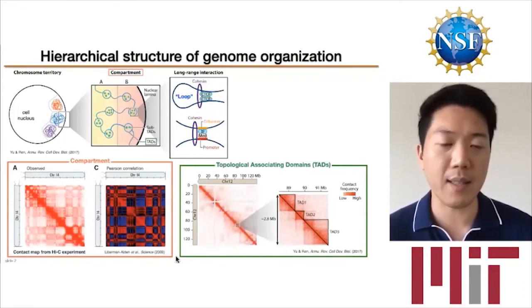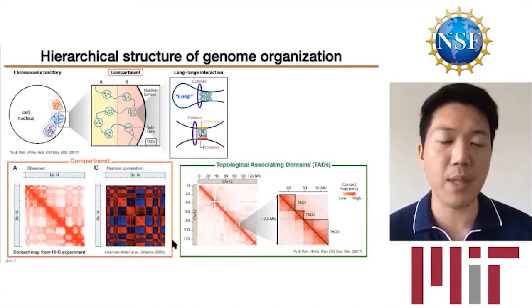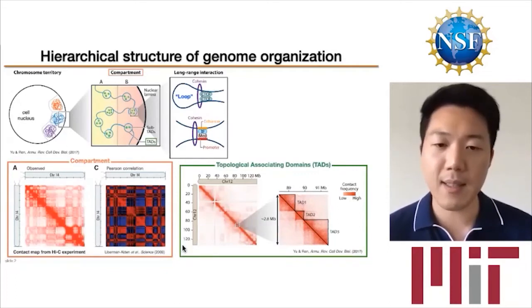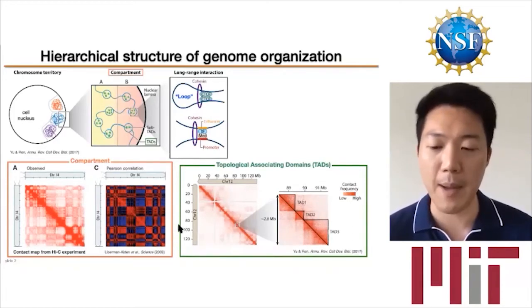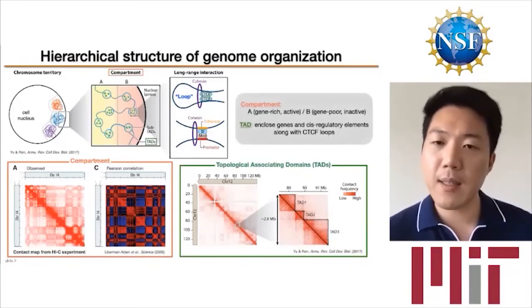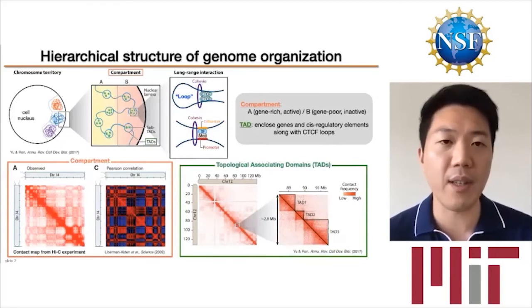which are well characterized by Hi-C experiments, as most of you are already familiar with. So I'm not going to go into too much detail, but basically compartments are shown as checkerboard patterns in the contact map and Pearson correlation map, whereas the TADs appear as strong enhanced contact near the diagonal in the contact map. These structures are somehow related with gene expression, and we can ask how exactly the genome organization and function are related with each other.